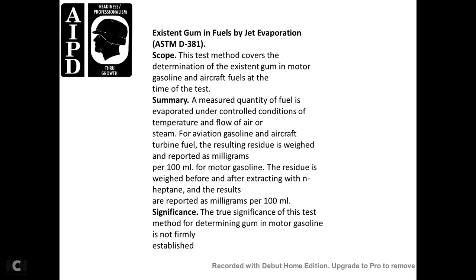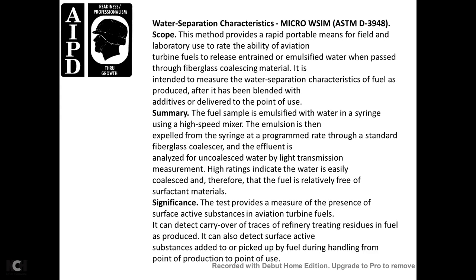The residue is weighed before and after extraction with heptane, and the result is reported as milligrams per 100 milliliters. The true significance of the test method for determining the gum in motor gasoline is not firmly established.